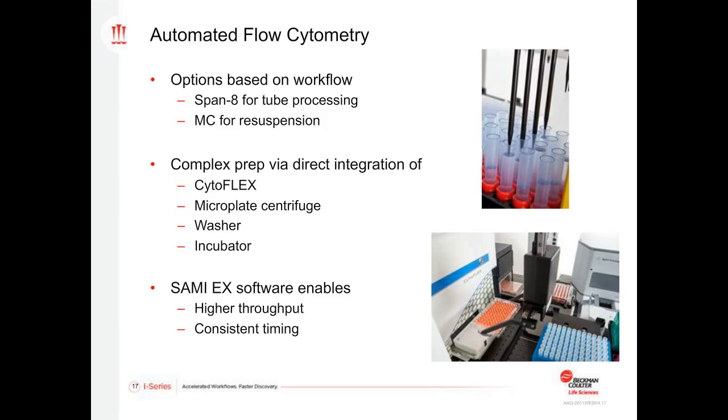What we showed today was a relatively simple example of just an add and read type of assay. However, most of the more typical workflows would require antibody staining, and this more complex sample prep requiring washes and reagent exchanges. These types of workflows can definitely be aided by integrations, and shown on the lower right-hand side, we did have an i5 system that we demonstrated the integration of the CytoFLEX itself. So if you were processing large numbers of samples, the integration allows the analysis to begin right at the completion of sample preparation without any intervention.